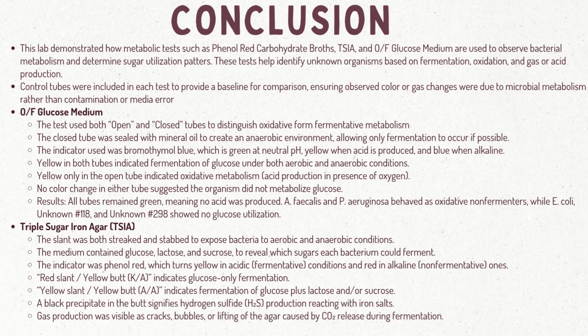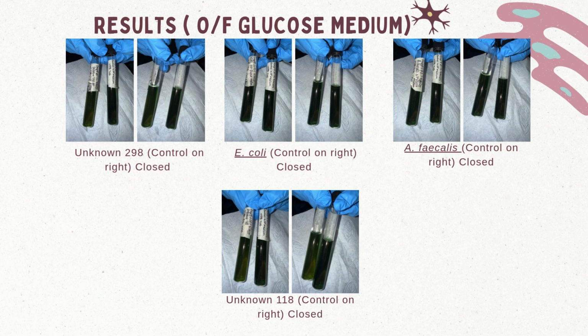So here we show the results from the different tests. Each photo compares how each bacterium reacted to different media. The color really helped us figure out the metabolism types.